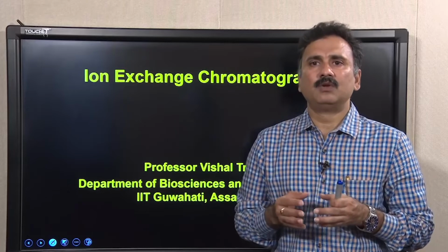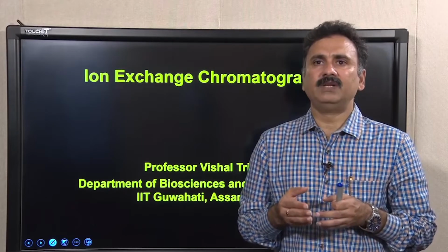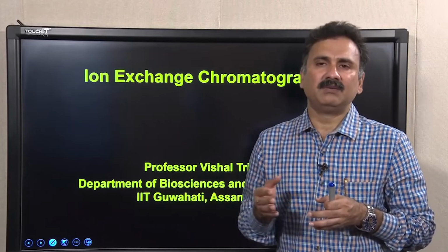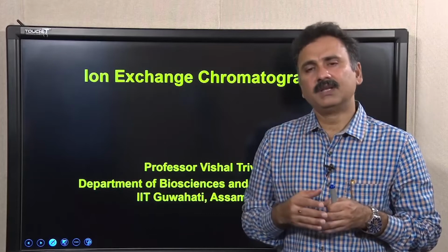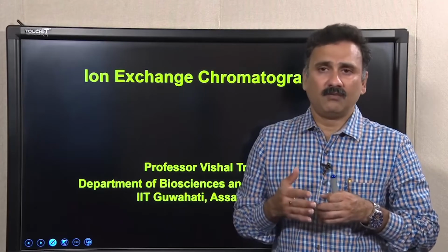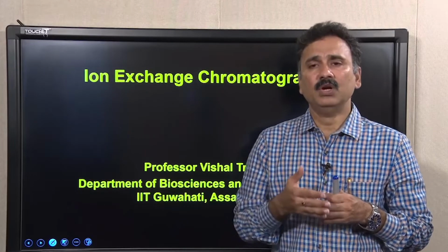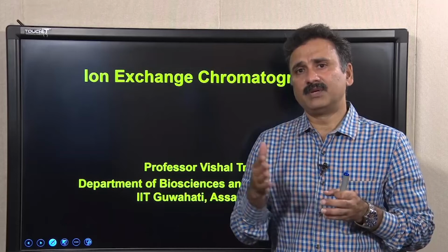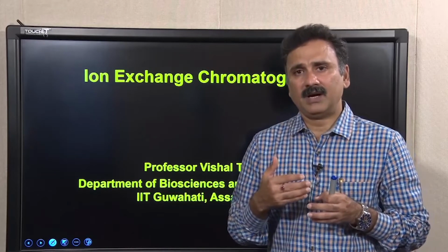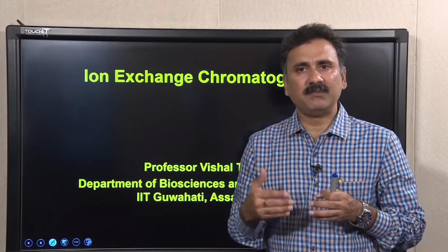In addition, we have also briefly discussed several applications of ion exchange chromatography for industrial usage as well as for daily uses. In that context, we have also discussed water purification, how ion exchange chromatography can be used to purify the different components of the water, so that the water will be free of the salt and the heavy metals and fluorides and all kinds of contaminants.